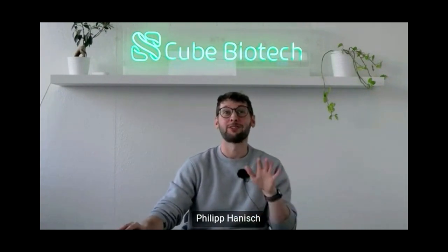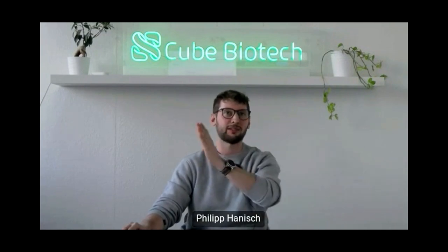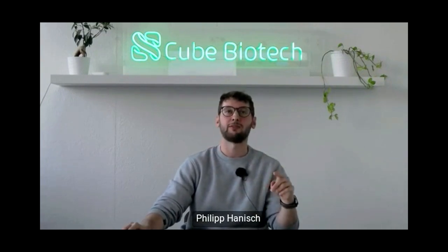And also a little anecdote, which I think maybe we even found out in the lab here, which is really cool. If you do your upscale, or if you want to compare different copolymers in purification efficiency, you can use the initial capillary scan, because the Prometheus scans all of the capillaries and auto detects them. And then it gives you a response unit by tryptophan fluorescence.